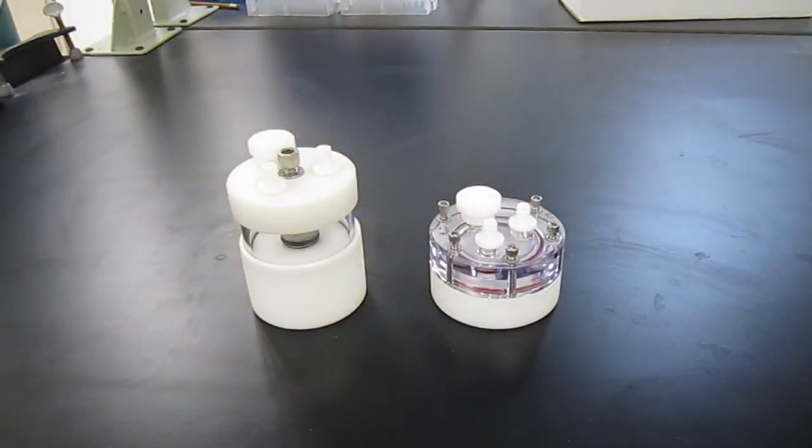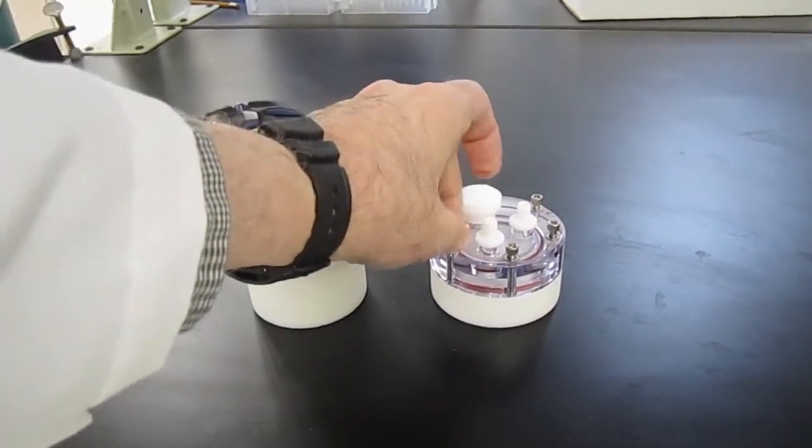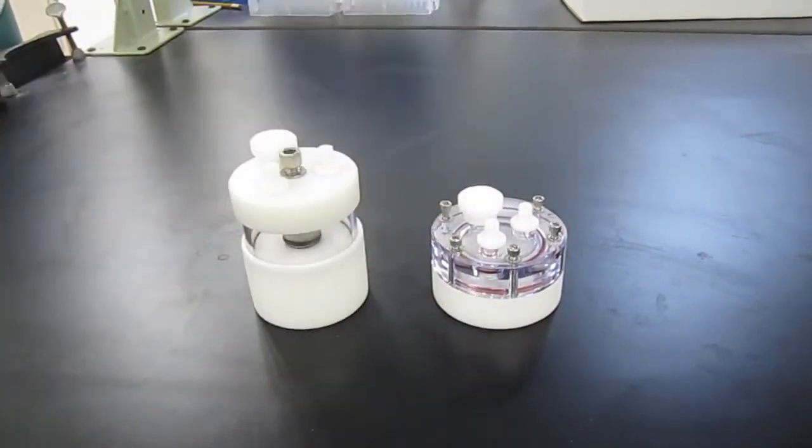After washing, the vessels can be placed in an autoclave bag or wrapped in foil and autoclaved at 121 degrees centigrade for 20 minutes. The bolts should be loosely tightened during autoclaving because the plastic parts of the vessel can expand.